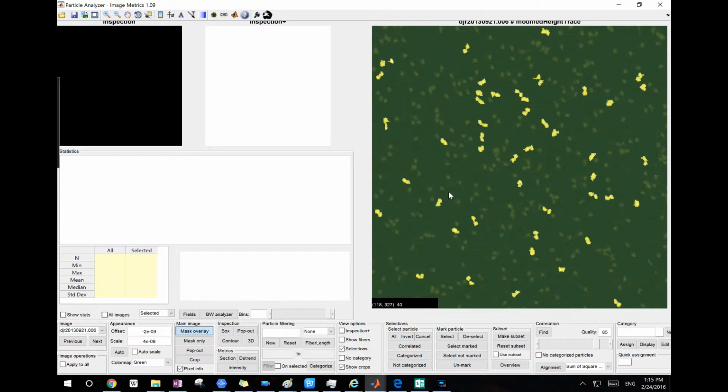As you see, there are many of these, like this one and that one, they kind of have a similar shape. They have a dumbbell shape, and some of them are more elongated, and I want to align them. So the first thing you would do is to pick a template. To do that, you just left click a particle. It's easier to pick a particle that already has some orientation pattern in it. Like this one is elongated.